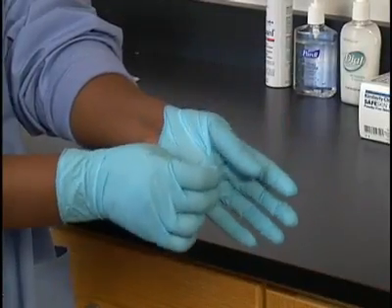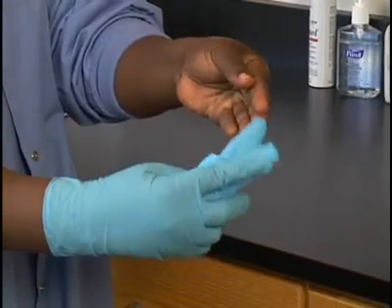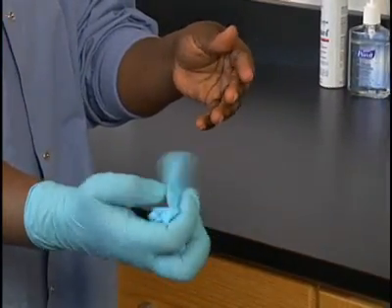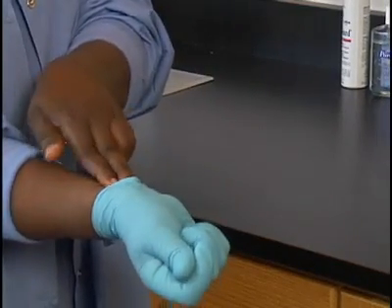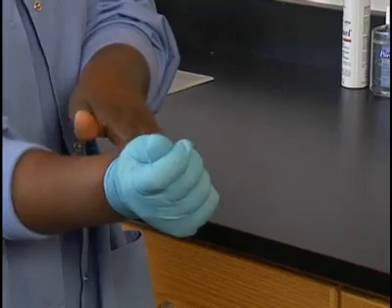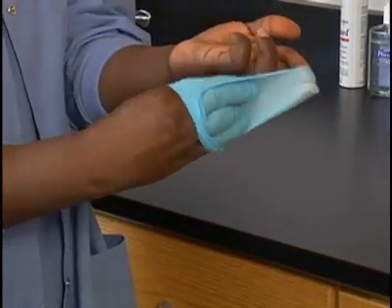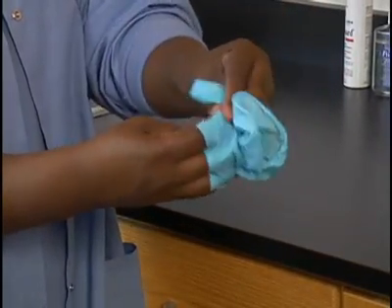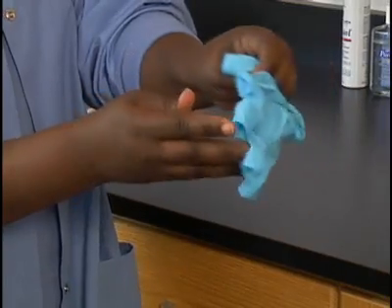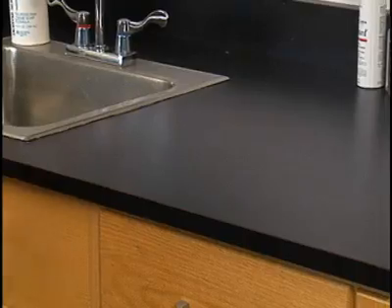Slowly pull the glove off of your hand. It will turn inside out as it is removed. Pull the glove free and scrunch it into a ball in your gloved hand. Place the index and middle finger of your bare hand inside of the remaining glove. Be careful not to touch the outside of the contaminated glove with your bare hand. Pull the glove off. Notice once again it turns inside out as it is removed, enclosing the balled-up glove.